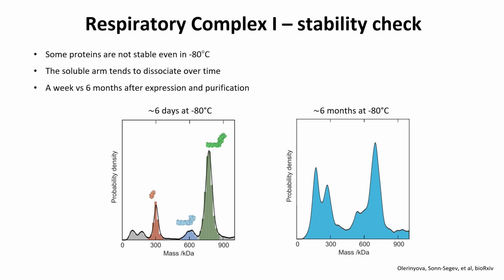And these results are related to a paper that we submitted. It's in bioRxiv, and it's discussing only membrane proteins in different mimetic systems. And if you work on membrane proteins, I encourage you to look at this bioRxiv and see how mass photometry can help you with your membrane protein.